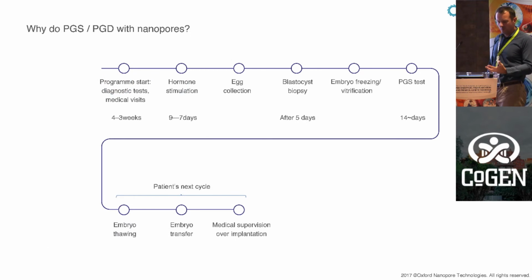Right, so I suppose the thing that I should be addressing is not why to do PGS, but why you should use nanopores to do PGS. There's a few reasons that I can come up with, and maybe some of them are more convincing than others to you. That's for you to judge.